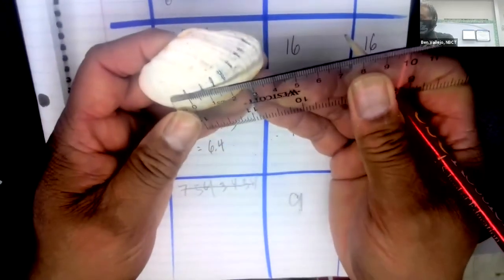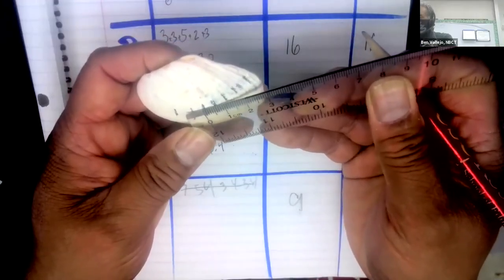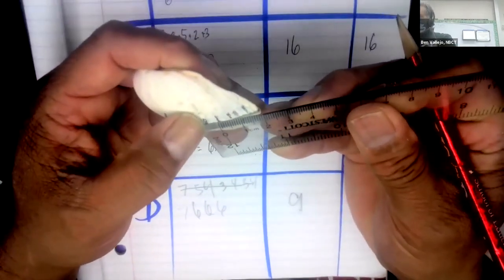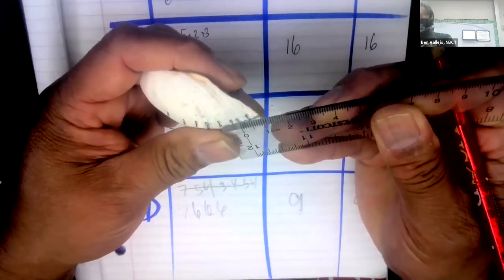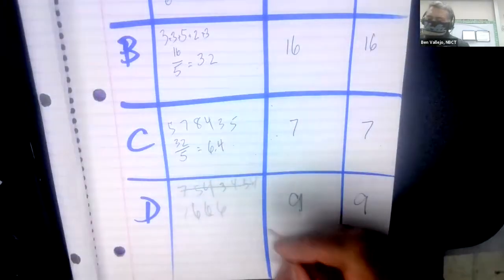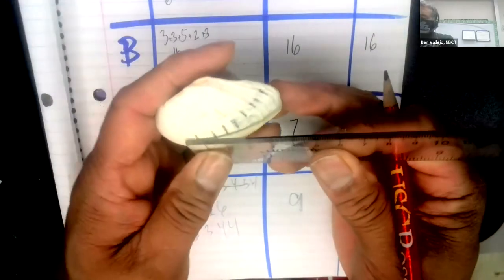And it's 7, 6, 6, 6, 6, 3, 3, 4. So let's look at that again.